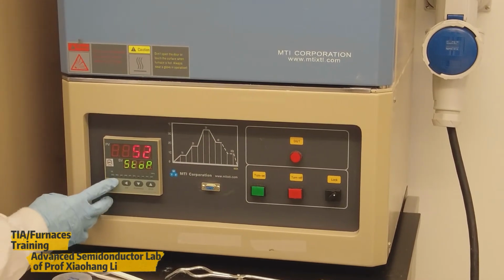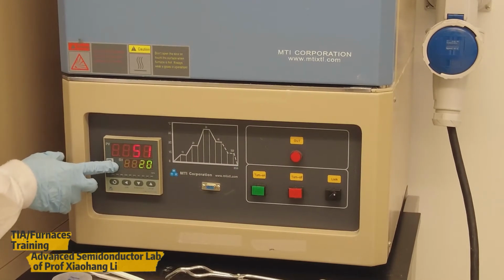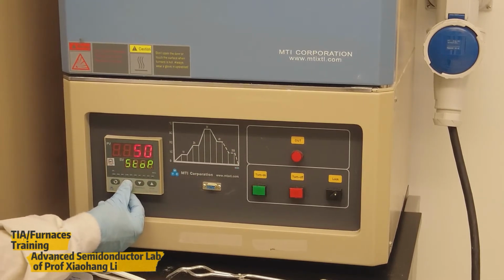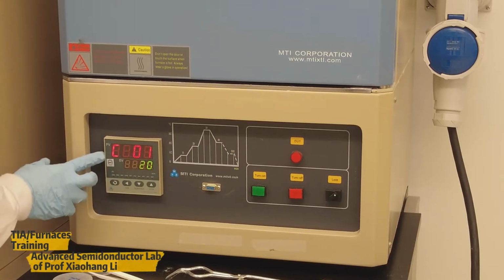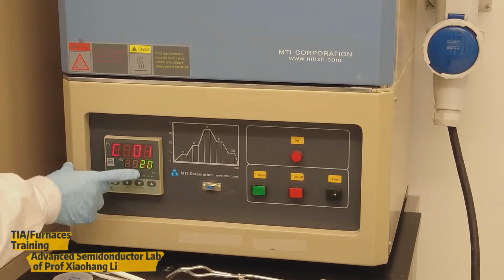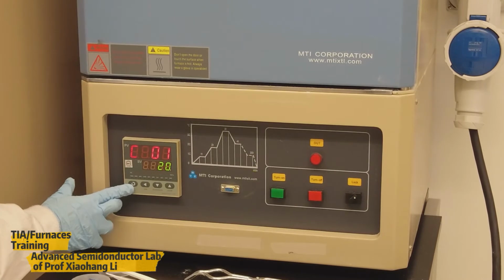Then we will do the program here. First, press this button until you see the stop show in SV set point, this one. Then you can press AM, this button. Here you can see C01. This is what we're going to set the temperature. First point, so we are setting 20. That means the room temperature. And then we go to this button.